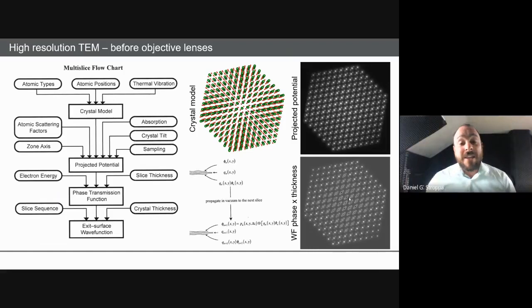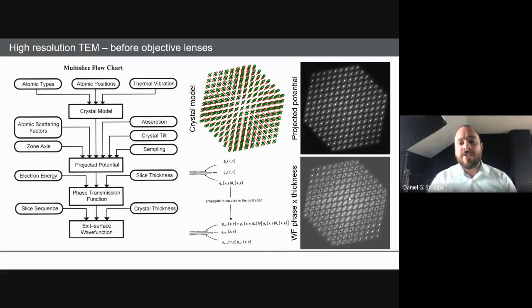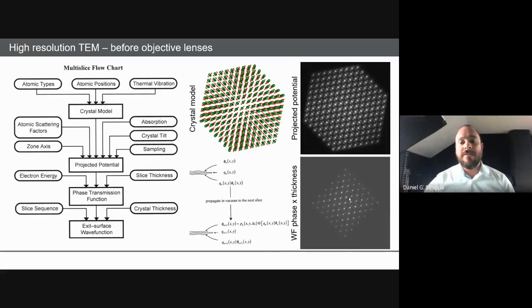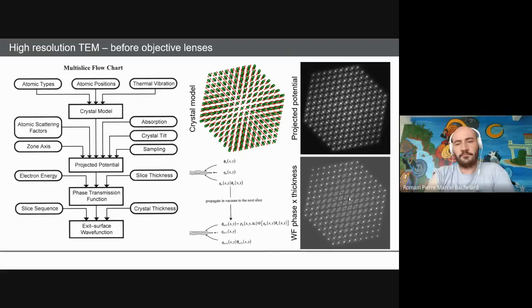And then this layer thickness depends on the material. If you're calculating organic material, for instance, or light elements, you can have even a nanometer layer in your calculations. It's going to work. And if you have gold, for instance, 1 atom may be sufficient to do this wraparound. So it's not a good approximation. Okay. It's not connected to the physical position of the molecules, the atoms. Yeah, what you need to retain is the physical 3D structure, but then you generate arbitrary slices to simplify the calculation of the wave propagation.